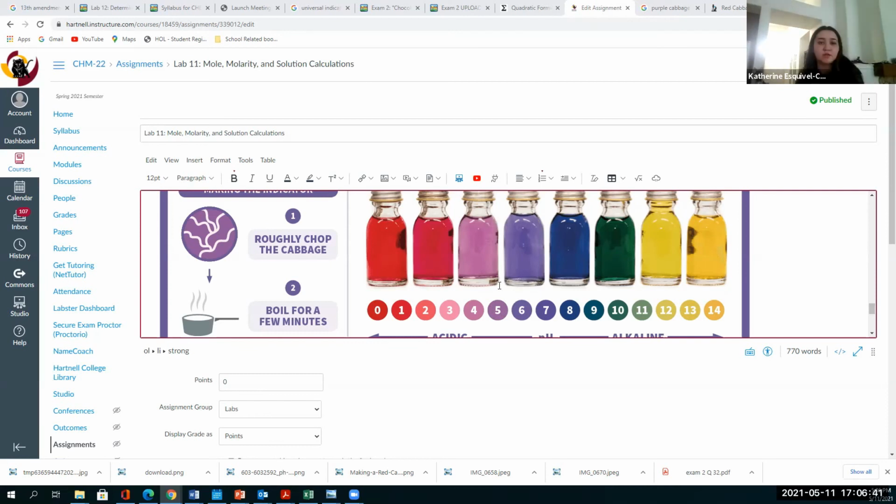Then after that's when we add the vinegar, right? Or the baking soda? Okay, so now you get the conical tube. Are you there? Did we lose her? I'm still here, it's just my internet cutting out.